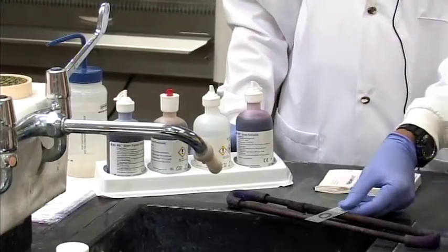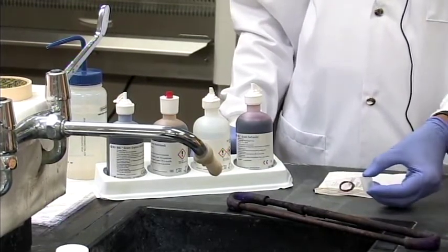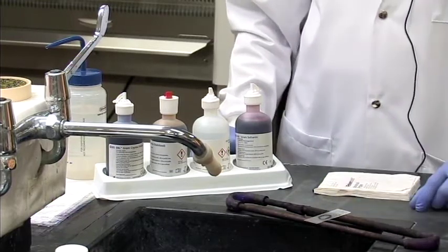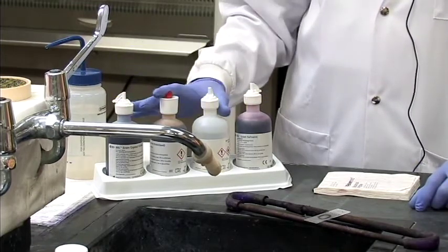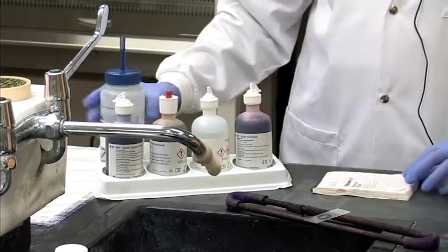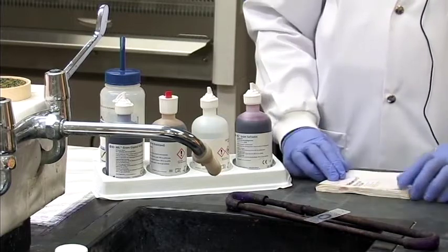Right, so we're going to continue with the gram stain procedure where we have made a previously heat fixed smear. We're going to take our slide or smear and place it on a staining rack, and then we're going to apply our staining reagents, of which there are 4. So you'll need our staining reagents. We will need some distilled water in a squeeze bottle, and we're going to need some blotting paper called bibulous paper for drying the slide.